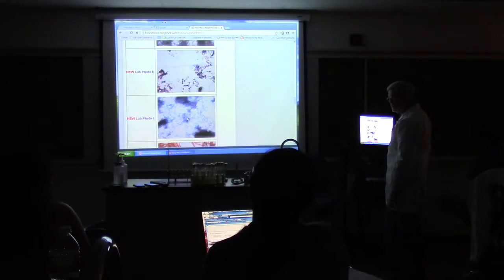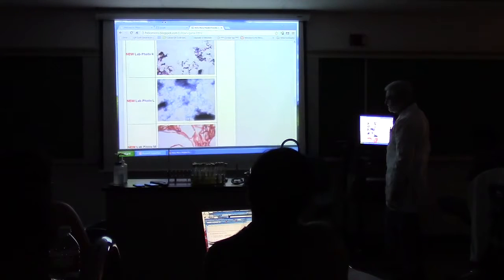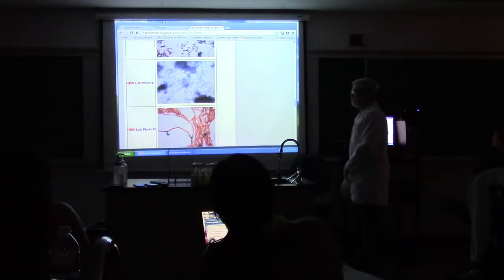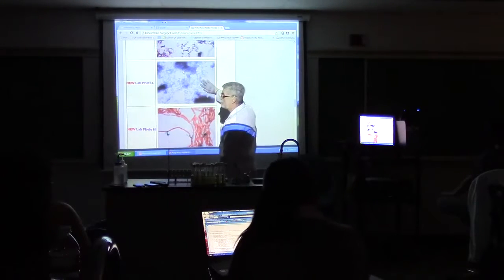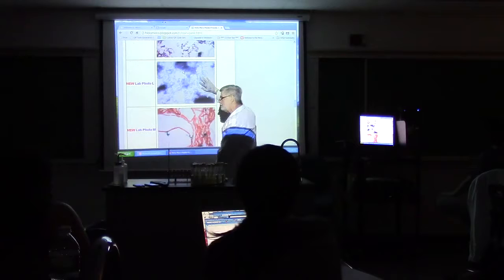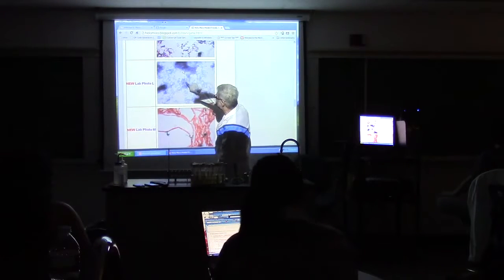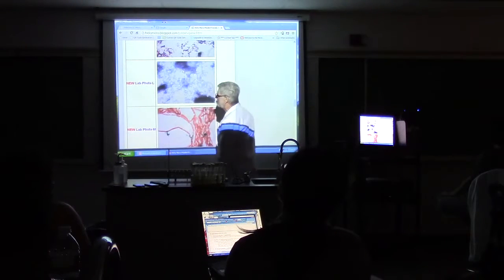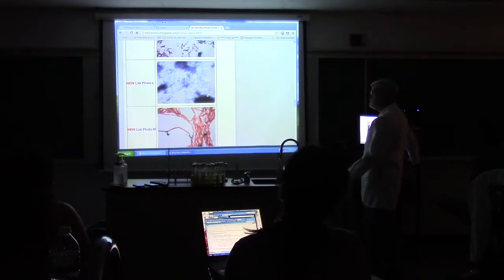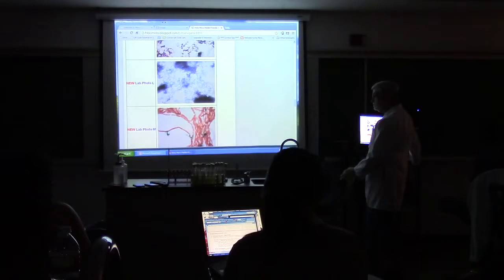Now this one is very hard to read. It is an acid-fast stain. These are a few hot pink rods and mostly baby blue. Since your color pairings are baby blue and hot pink, and this is definitely baby blue, it couldn't be anything else, this has to be an acid-fast stain. And how many does it take to make acid-fast positive? One hot pink rod. So there you can see there are hot pink rods. That one's not quite as obvious, but if you remember your one hot pink rod, you'll be fine.